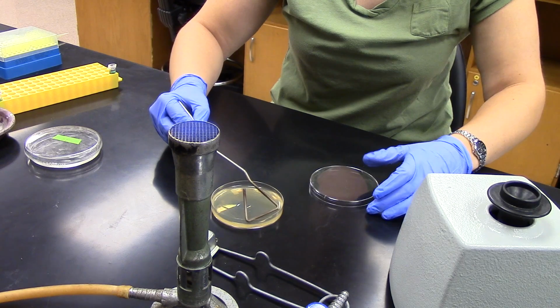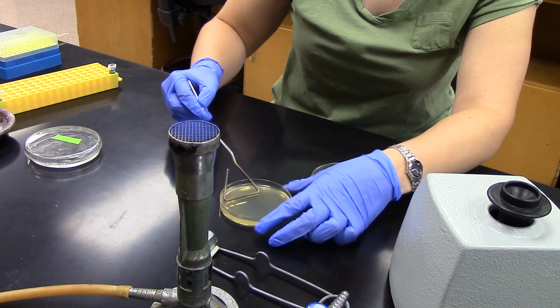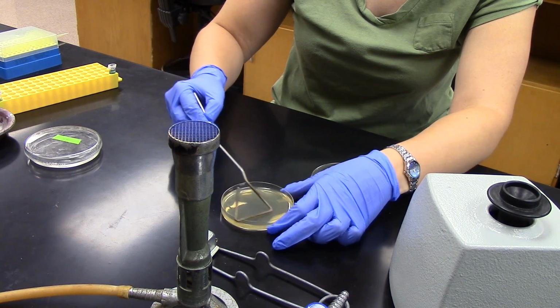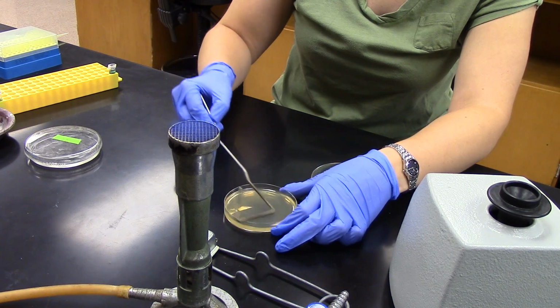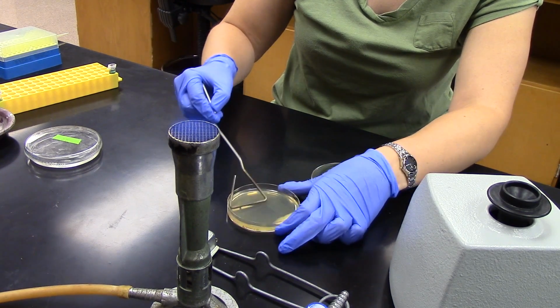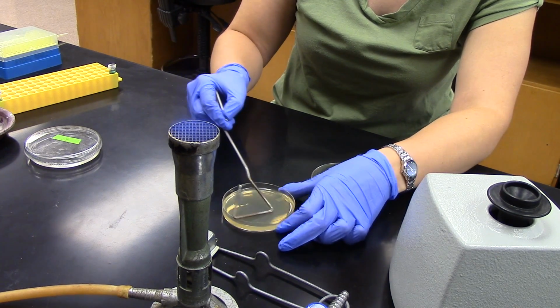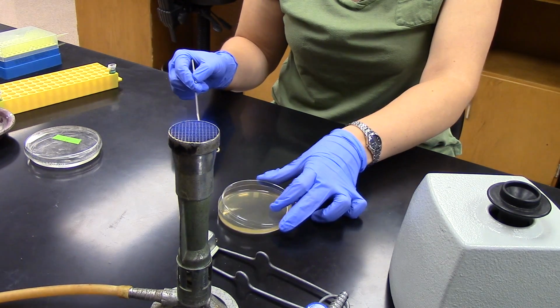Put the spreader on the agar, not directly onto your bacteria or yeast initially. If you do that and your spreader's really hot, you might hear some Rice Krispie noises, which would be your yeast or bacteria popping open. And then to spread, you can see you go back and forth with the spreader. Make sure you go all the way against the wall of the plate, and you use your other hand to just continually turn the plate. Do that until you feel like you've covered the whole plate relatively evenly.